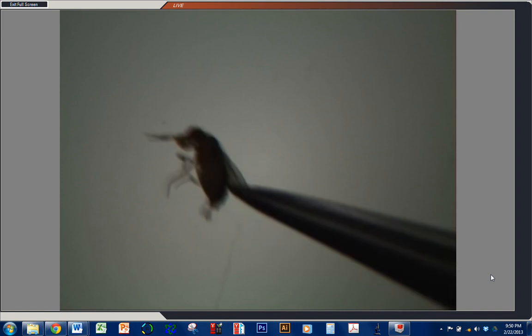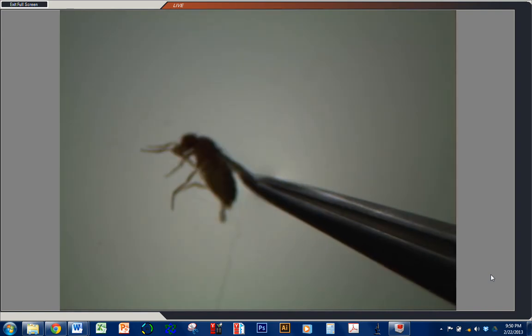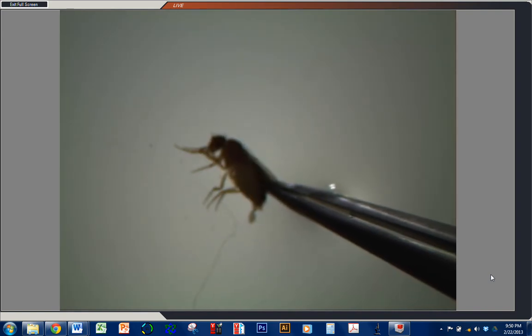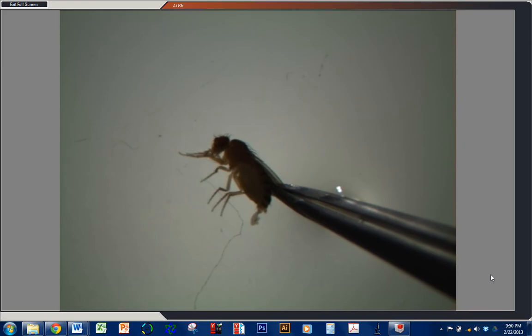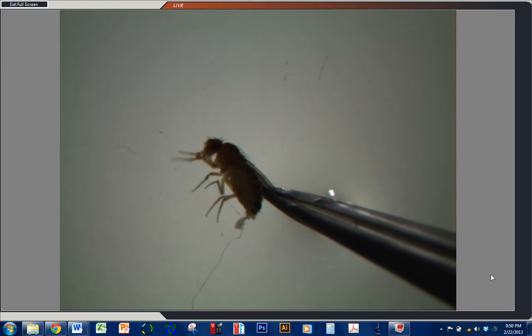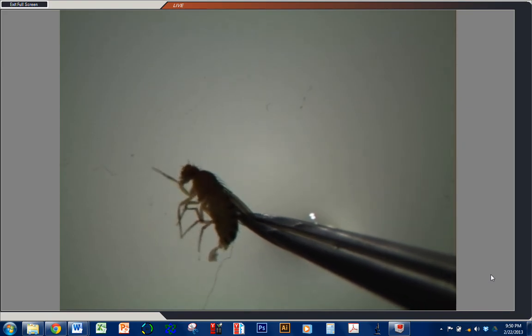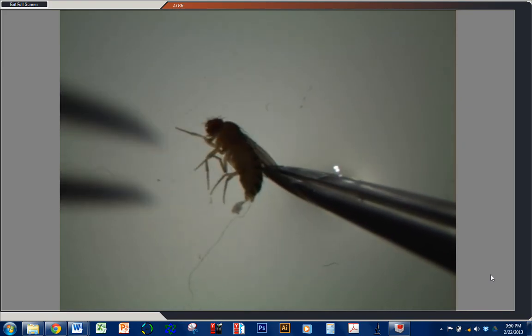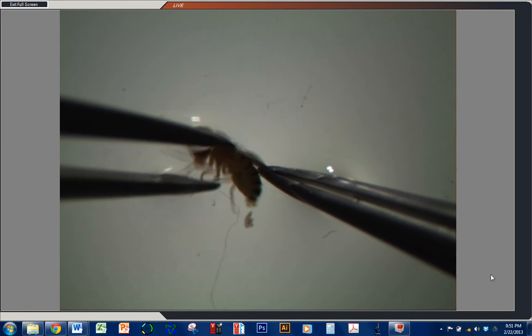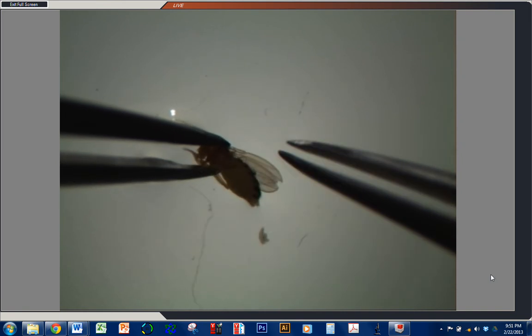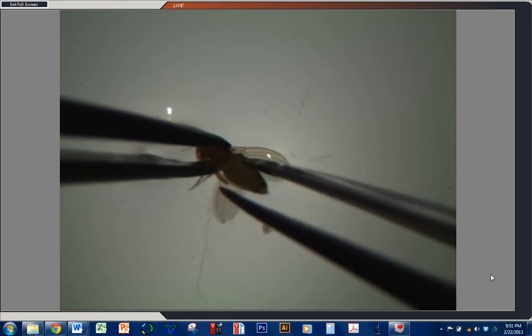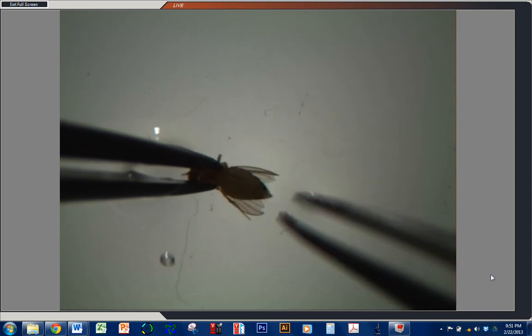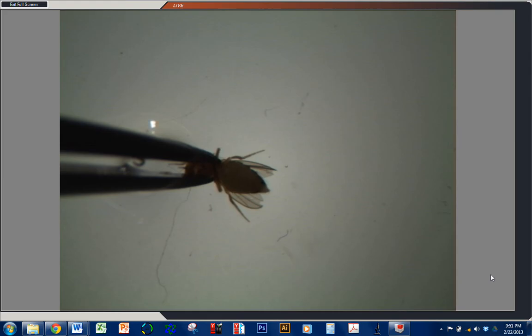Next we're going to add our fruit flies. So these fruit flies have been fed yeast for about three days. And the way we do that is by putting dry yeast in a fly vial, a fly food vial, and allow them to eat that for three days. That allows the ovaries to grow and for all stages to be represented approximately equivalently.